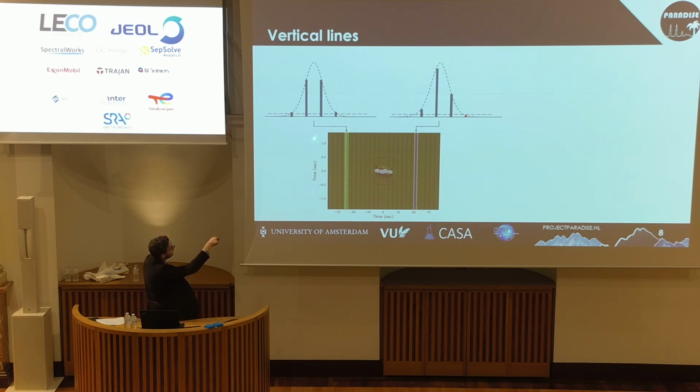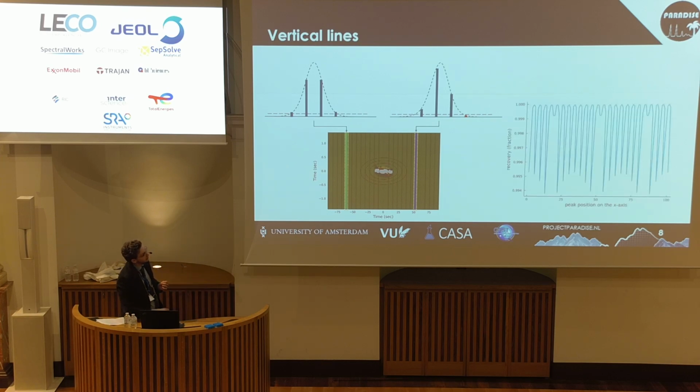Now, if I just take the top row and plot it as a function of the first dimension, you can see what is going on, and you see this pattern emerging that results from this effect. However, I also want to point out, because we're simulating, we can see very minute differences, because even the most extreme dip here is still 99.4% recovery. So this is something that in an experimental scenario would be quite hard to spot, because it's probably within the margin of error of your repeatability and this sort of thing.